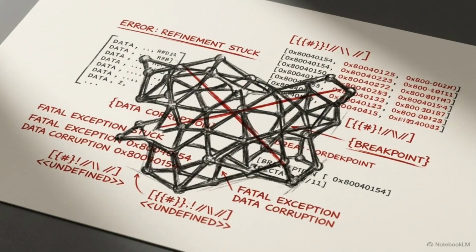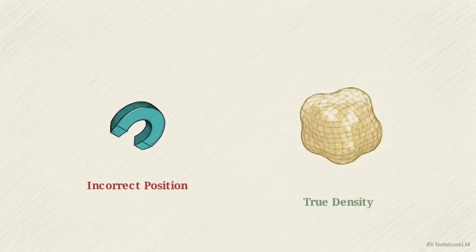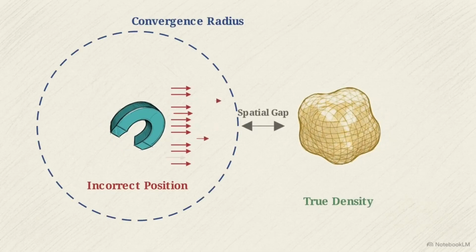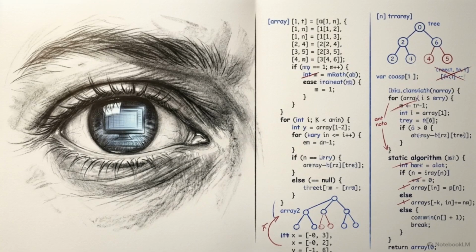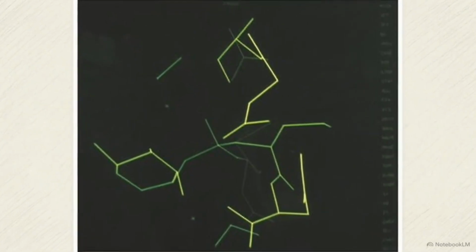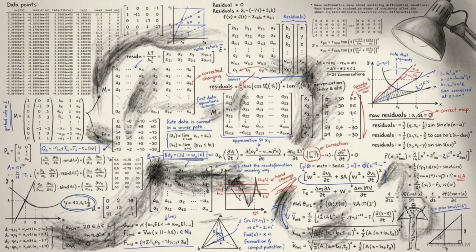You cannot fix this by feeding the biased model straight into a purely automated mathematical refinement algorithm. Large positional errors, like an entire chemical loop facing the wrong direction, exist far outside the convergence radius of reciprocal space algorithms. The computer only makes micro-adjustments. It cannot entirely detach a sidechain and flip it across a void. Escaping this trap requires an alternating system. A human must manually intervene in real space, using 3D graphics to rebuild the model, followed by the machine performing mathematical optimization in reciprocal space.